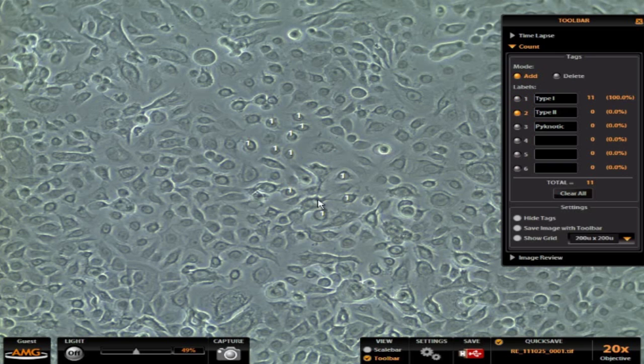I can switch over to type 2s, these will be the flatter type cells here. And for pyknotic cells, we can pick, say this cell here looks like it may be dying. So this is how you go in and manually create your cell counts.